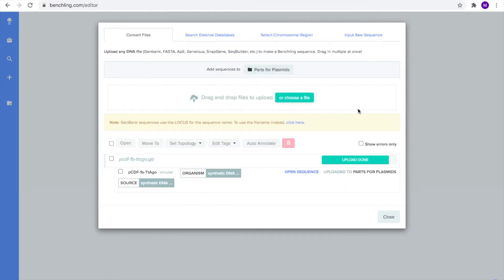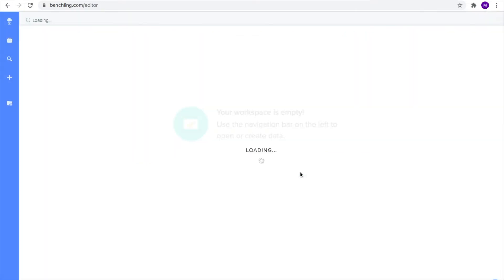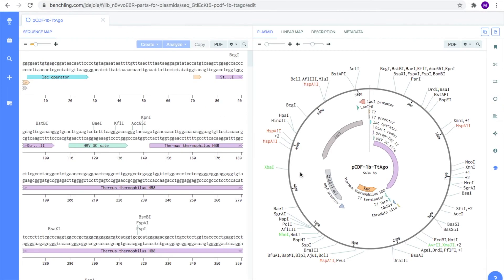After the sequence is done uploading, click on open sequence, which is underlined in bold. Now you should be able to see your plasmid on Benchling.